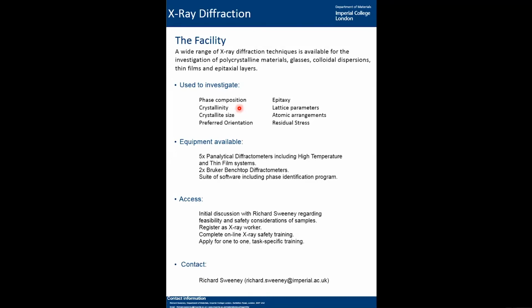And when you're down to about 100 nanometers, you will see that broadening start to occur. And then as the size goes down to probably 50 nanometers, you can probably get an estimate of the crystallite size. There you can do a calculation based on half width. But when your crystallites are down in the, say, 10 nanometer range, 1 to 10 nanometers, it's a brilliant technique. It's very sensitive, and it's very quick and easy to get an estimate of your crystallite size.